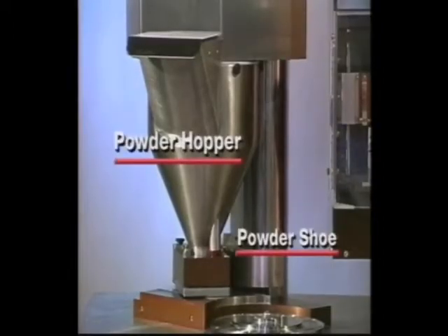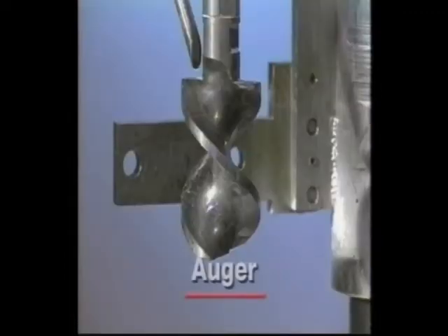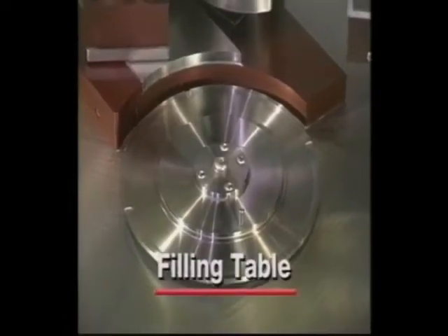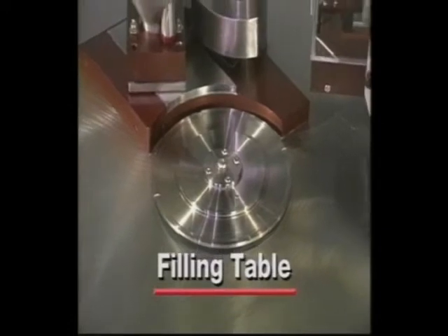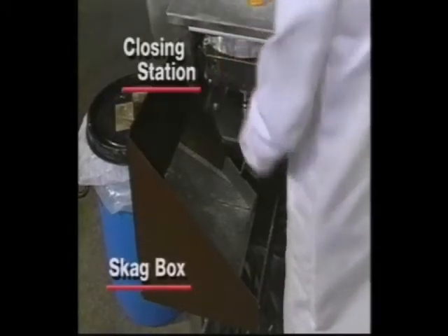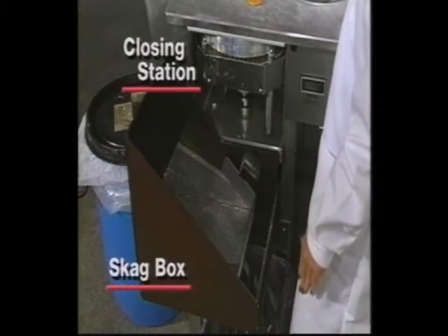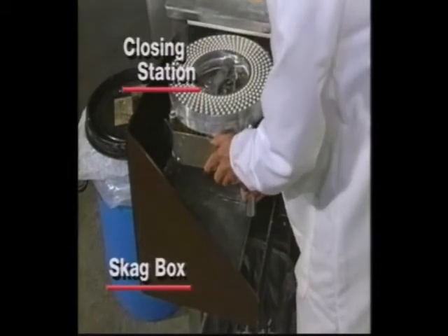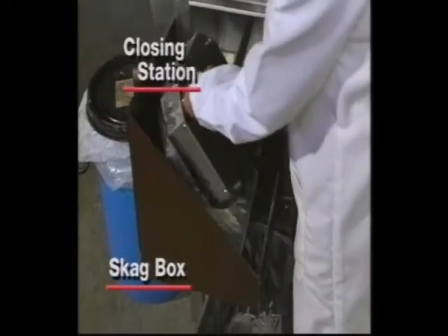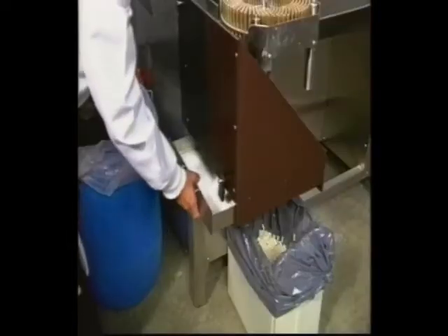The vacuum creates suction to seat the capsules into the rings, thereby separating the capsule caps from the capsule bodies. The powder hopper holds your powder and is located directly above the powder shoe. The auger controls the amount of powder dispensed into the capsule bodies. The filling table rotates one full revolution while the capsule bodies are filled with powder. The closing station securely rejoins your capsule caps and bodies. Finished capsules are dumped over the skag box into the capsule holding bin. The bottom of the skag box is made of perforated metal, and any excess powder or broken capsule pieces are filtered into the skag drawer located under this screen.